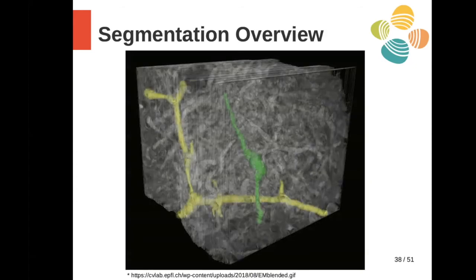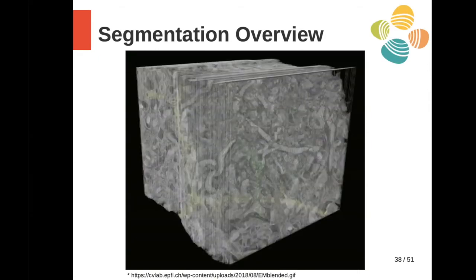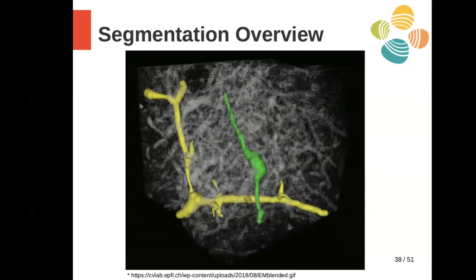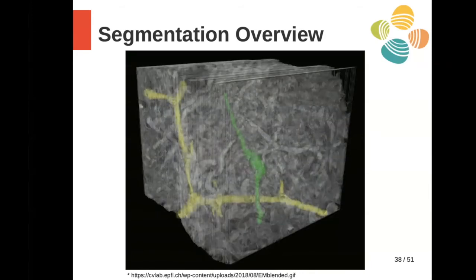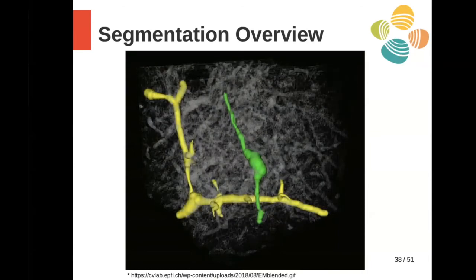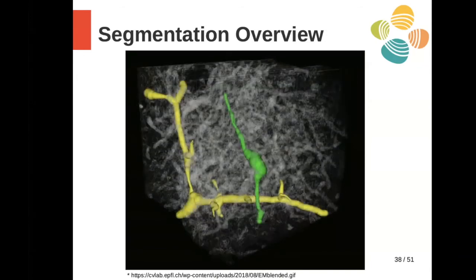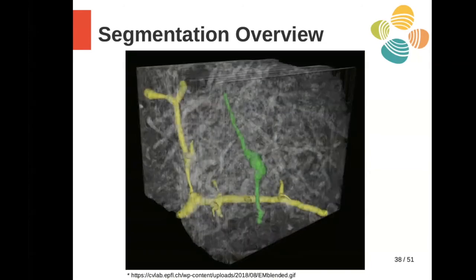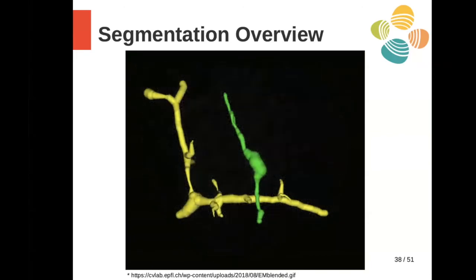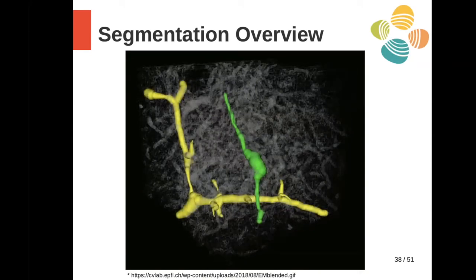So here is an example of an image stack and a label stack. We're slowly dissolving the image stack away, and what you get is the object. In this case, what we will have done is segmented out connected features in the image space and labeled them as belonging to the same object because they're all touching. By the time we're done, we will end up with these labels, and these labels can be turned into actual objects, 3D meshes or descriptions or other things like that.